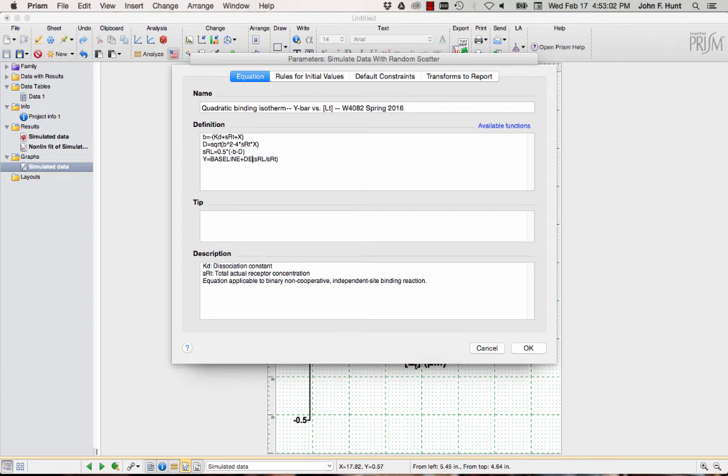let me go delta. One of the slides in the PowerPoint covers this. My observed experimental observation, which in this case I'm simulating, given by the y variable, is going to be some constant value plus some scalar constant times the fractional saturation. So what this is saying is I'm getting a signal that is linearly proportional to fractional saturation, and then that includes some baseline value. Most detectors and most real experiments work this way.